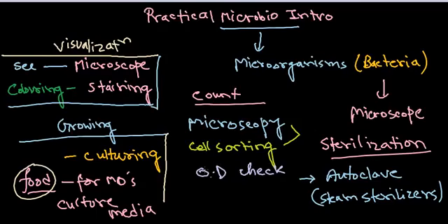course, right? So for these different purposes, different machineries are required, different glasswares are required. For example, for microscopy you require a microscope. For staining you definitely require slides and cover slips, right? And for growing this particular bacteria, you need special media containing food, and also the matrix. You need to provide the solid matrix, and the matrix here always works like agar. We'll be talking about them later in detail.